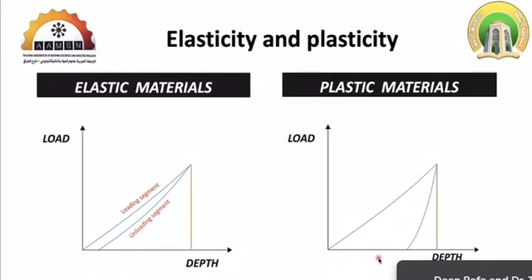لا نفس الشيء دكتوره، نفس الاكيورسي، وهي البتلز وهي السيراميكس وهي البوليمرز فور ايفريثينج. ماكو اي فرق. يعني هو يستخدم بالتاير اندستري بصناعه التايرات، ويستخدم بالسيمي كوندكتور اندستري، يستخدم بالثين كوتنج، الثين فيلم، فيستخدم فور ايفريثينج.